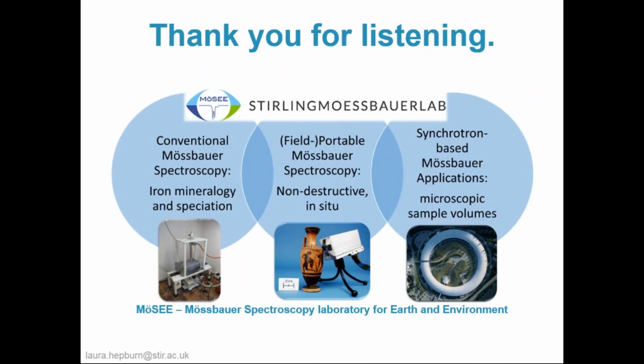We've been looking at them in total iron concentrations and assuming that these extraction techniques and the concentrations produced from each one are specific to carbonate, specific to magnetite, specific to pyrite. If these are not correct, then, for example, use of this as a paleoproxy to define anoxic and oxic water columns means that these boundaries aren't lying where we thought they are.